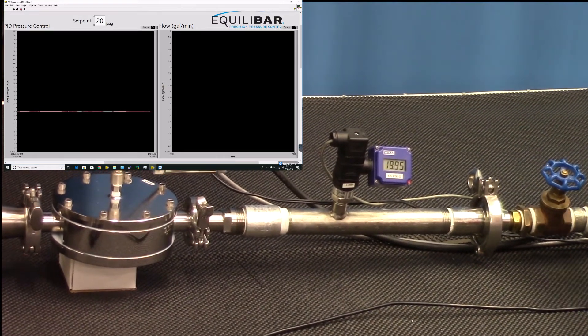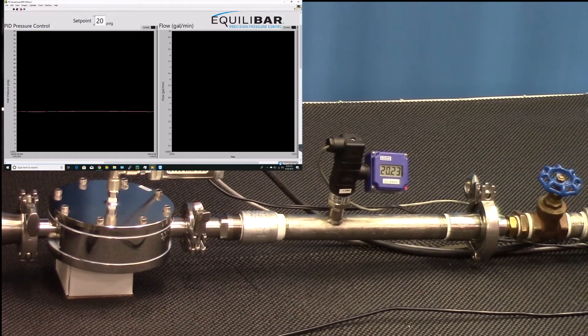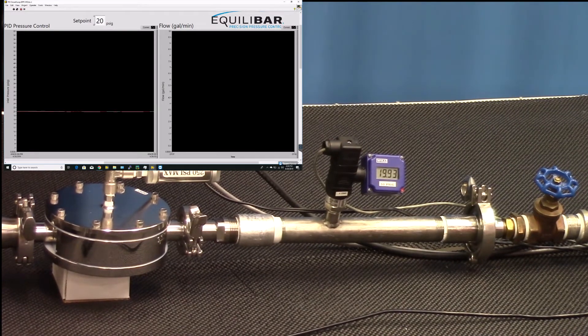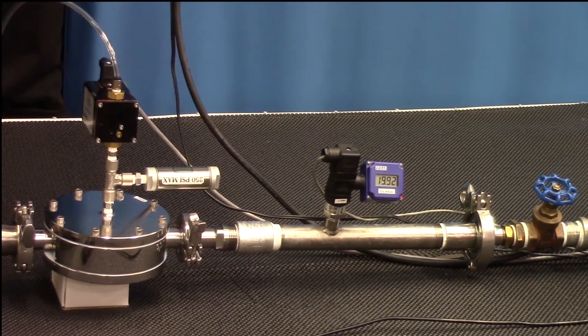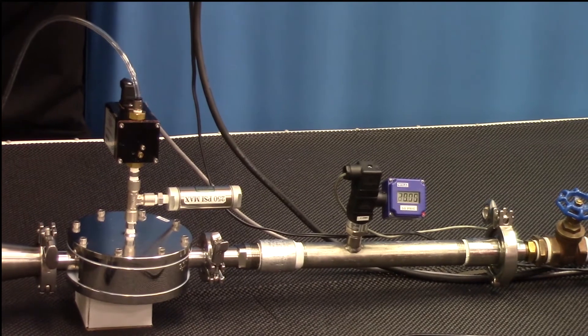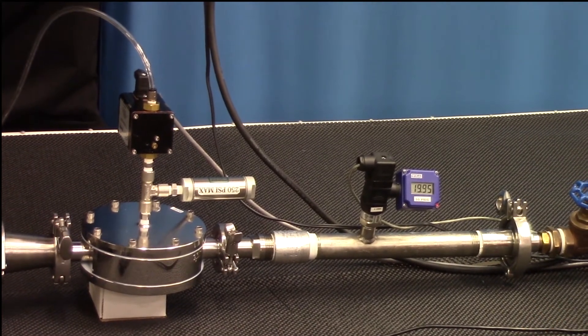We'll slowly ramp this up again, and now we're almost to 10 gallons per minute. So now we've maxed out the capacity of the system, and we see the valve has stably responded and is reading almost 20.00 psi on the inlet pressure gauge. Let's go to an even higher flow capacity and see the resolution there.